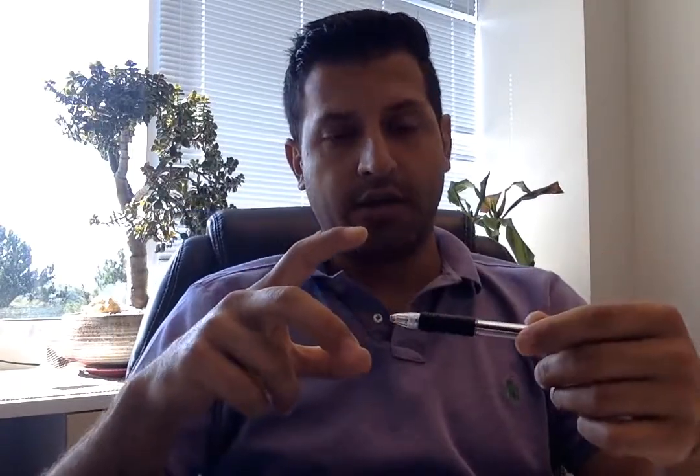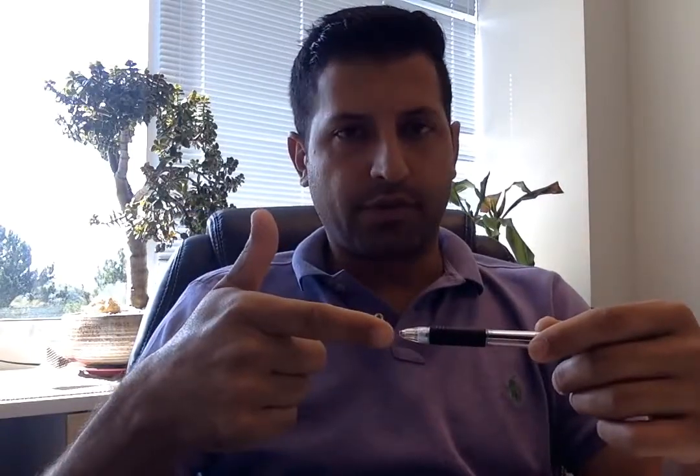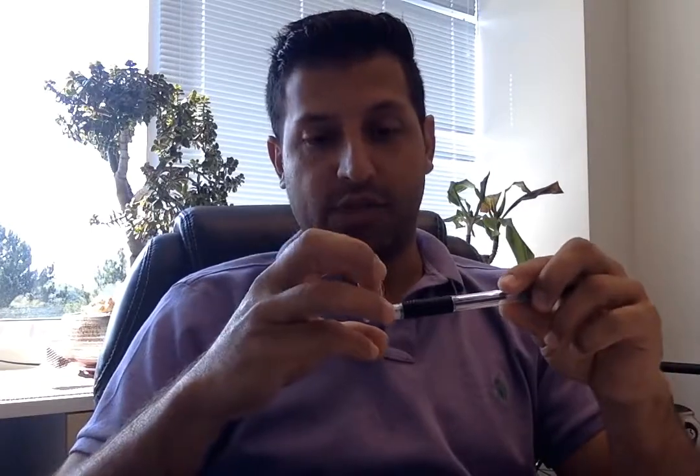This may not be a problem in areas of the brain where the neuronal density is not very high, because you may have one neuron or maybe two neurons and the shape could be different. But when recording from an area of the cortex where the density is very high, you may have 10 neurons within the recording radius of this electrode. You need a better way to be able to distinguish between these different neurons.